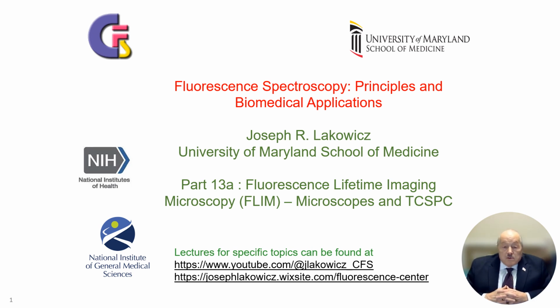Welcome back to the course on fluorescence spectroscopy. We're going to begin our discussion of fluorescence lifetime imaging microscopy.